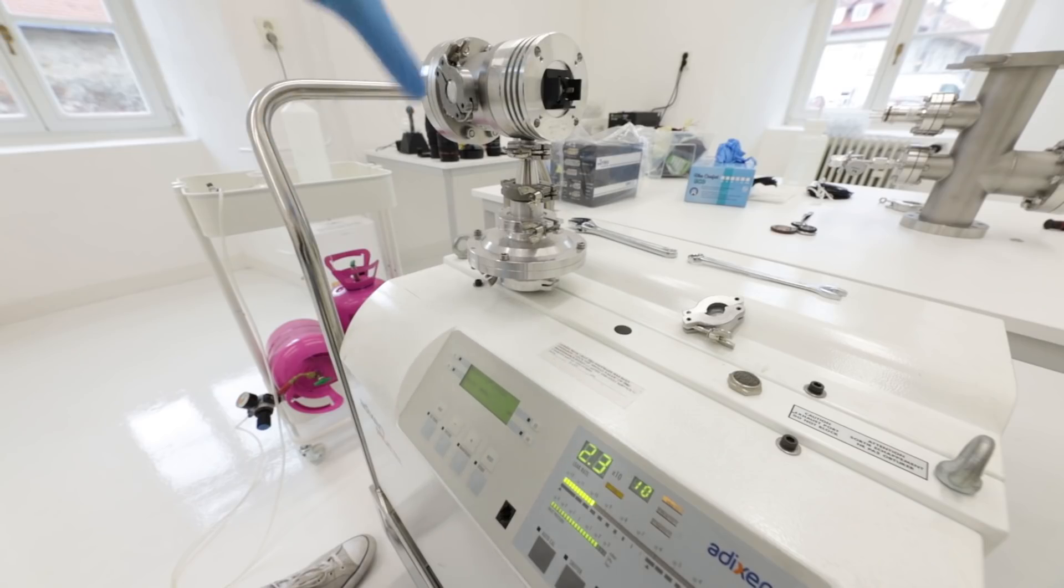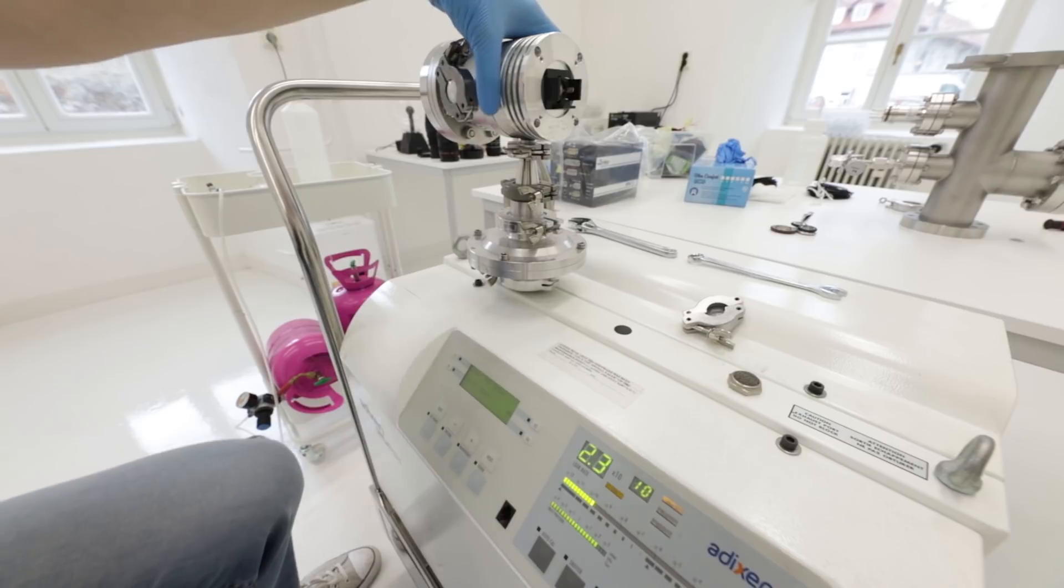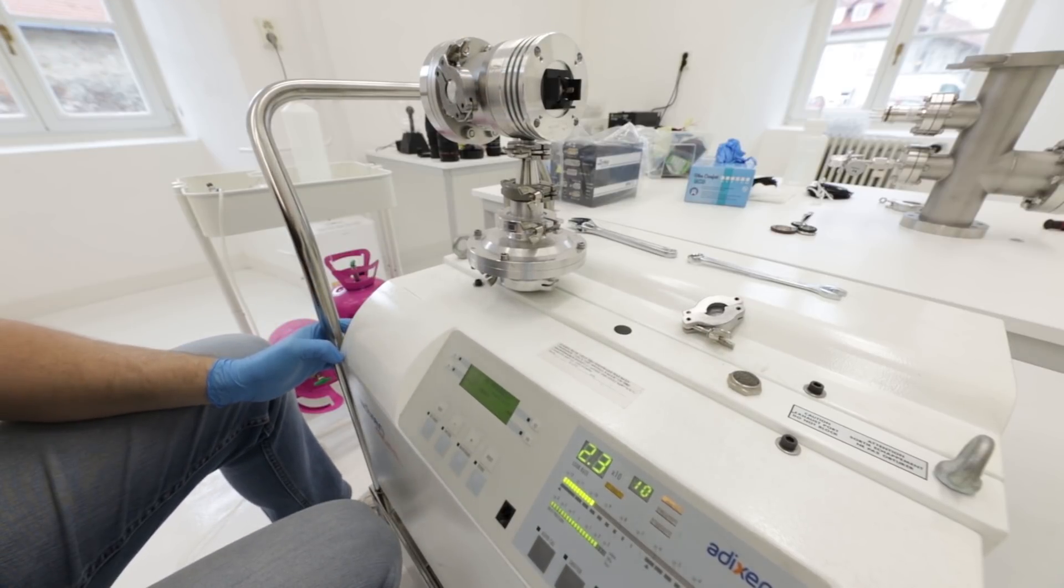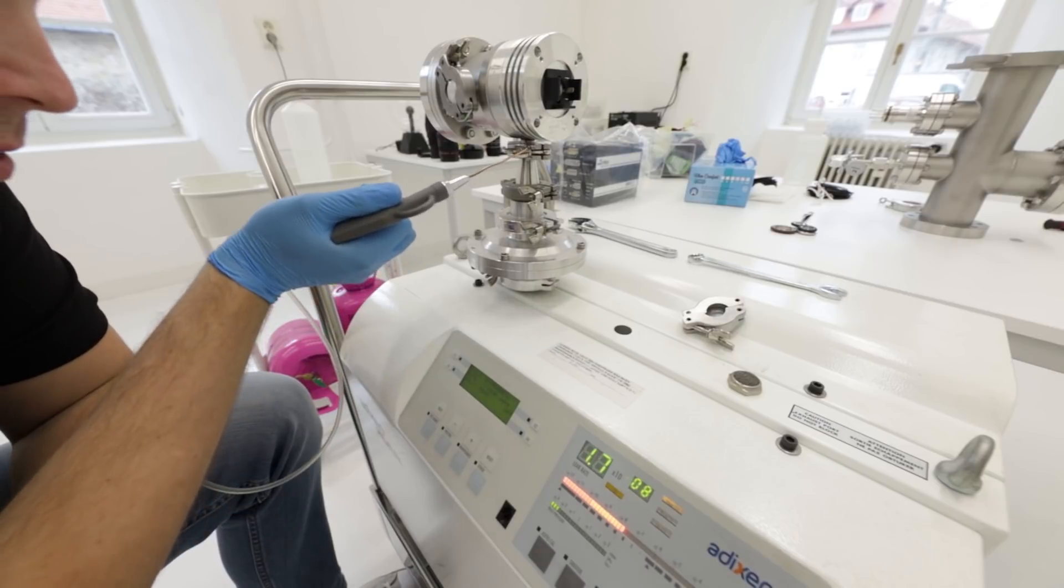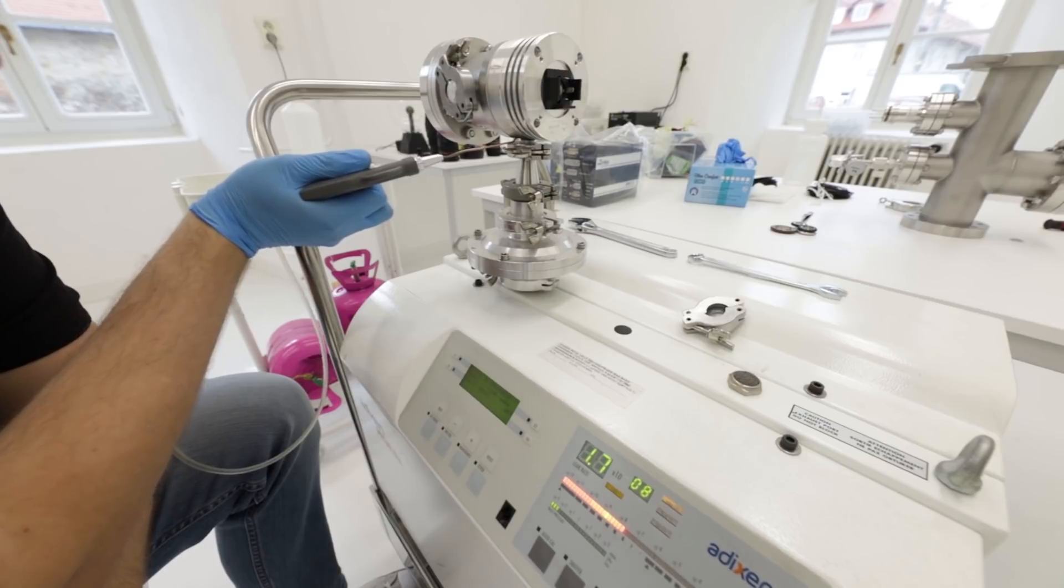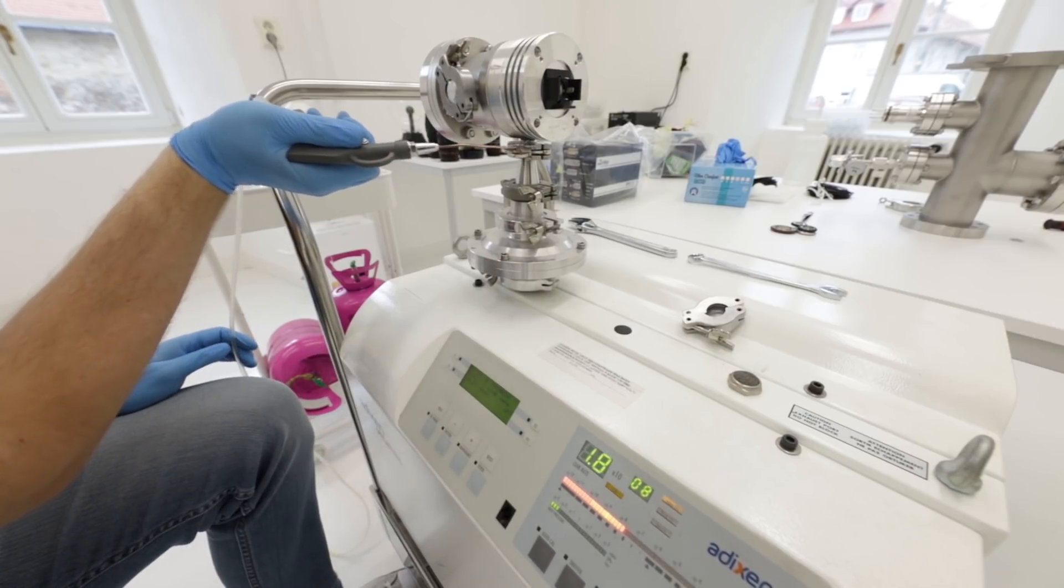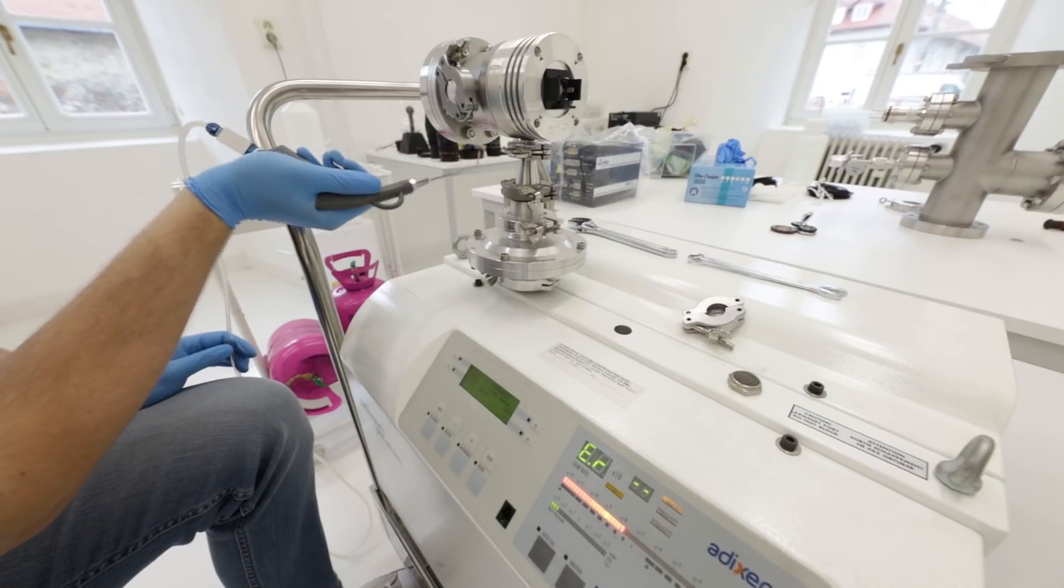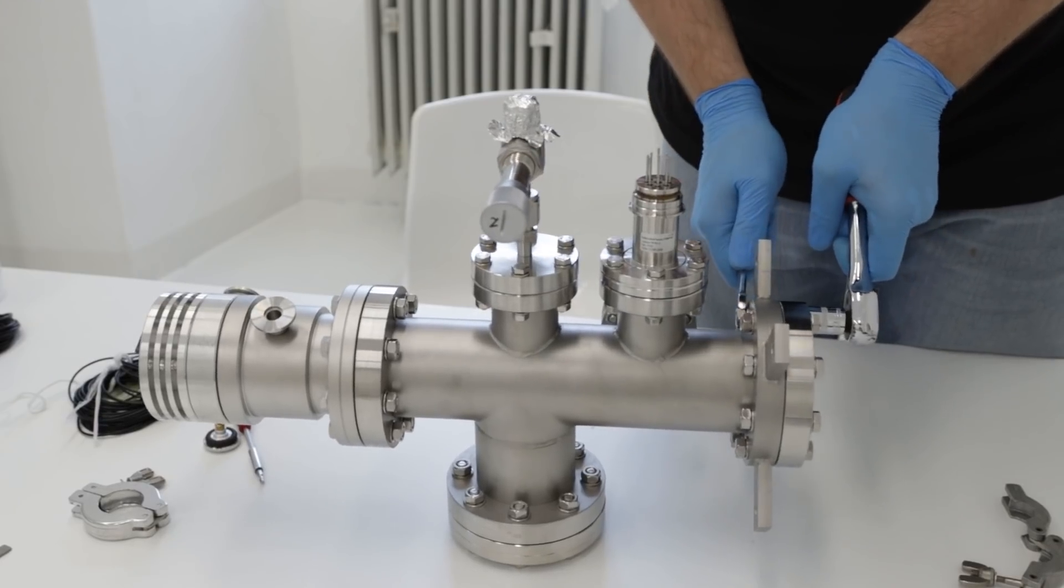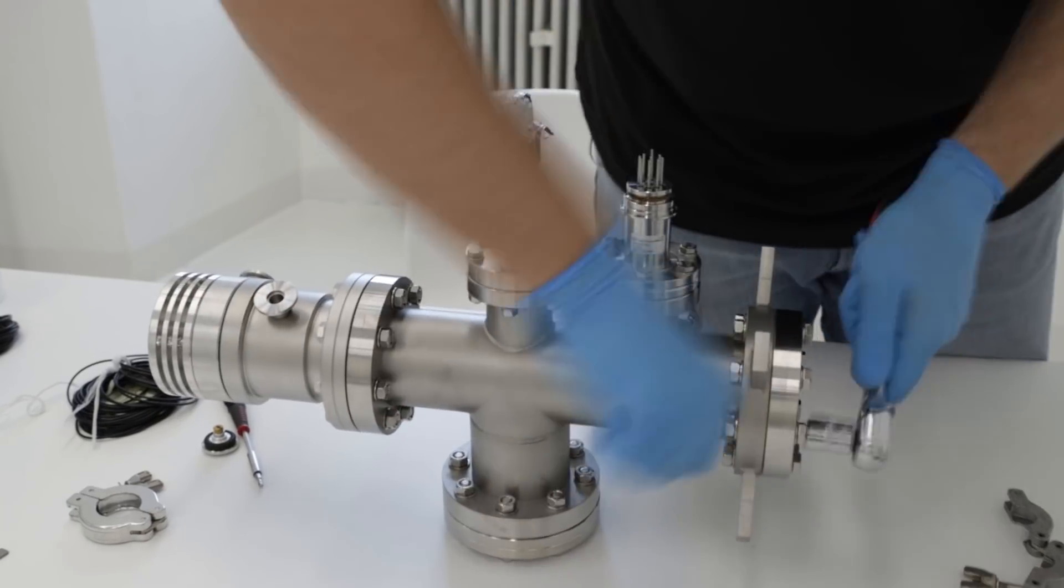So final test after replacing this bottom part. Let's hope that it will be fine. It looks good. There's no response to the helium, so it means we fixed the leak. The strong signal that we're getting is because everything is now saturated with helium - the machine, the air inside the room, everything. So it will take a couple hours to get rid of the helium.